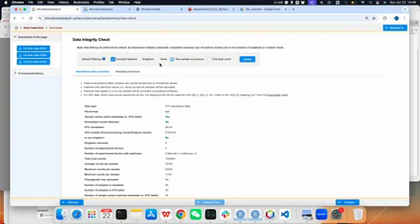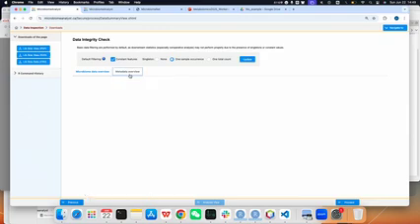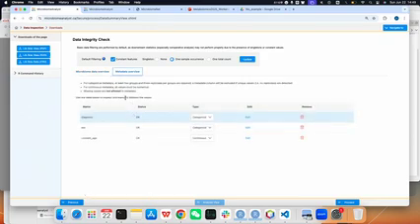Sometimes your sample is focused on the rare species, then you have no need to remove the singleton. So in this case, we just keep the default. And then when you change the tab to the meta overview, you can see the metadata in your data set. So we have basically 3 columns. The first is the diagnosis. It has 2 groups, the CD group and the control group, then the sex and the age.